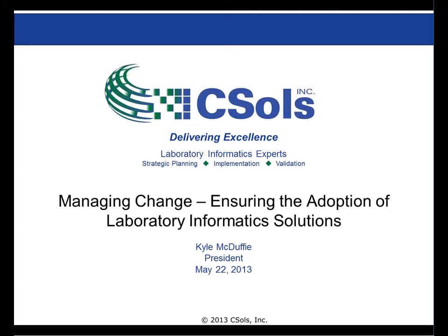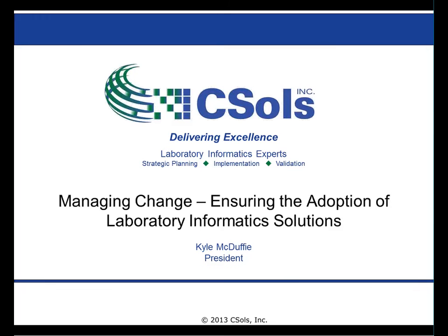to my heart. The only other thing I'd like to mention is I am originally a chemist by training and got into laboratory informatics because I was running an analytical laboratory in a 24/7 environment, and we needed a way to do things more efficiently. So that's way, way back where I started. But today's topic is about managing change and ensuring the adoption of laboratory informatics solutions. Without further ado, I'll jump right into it.